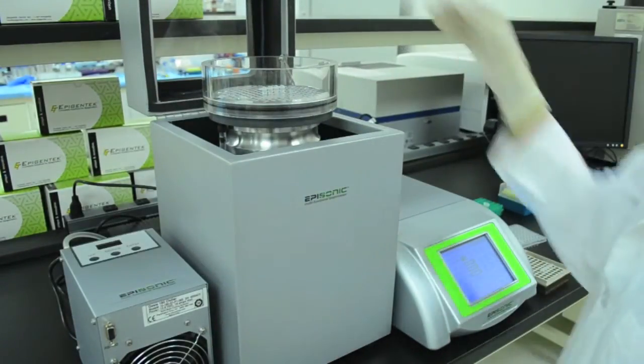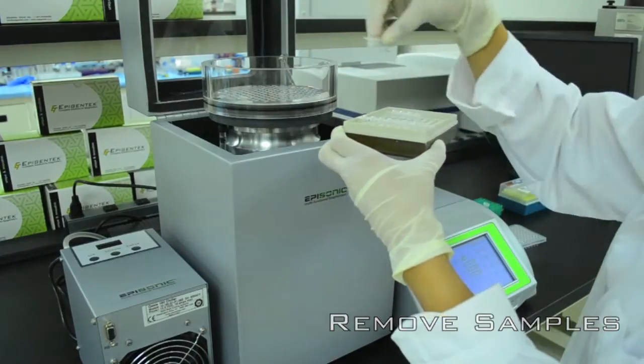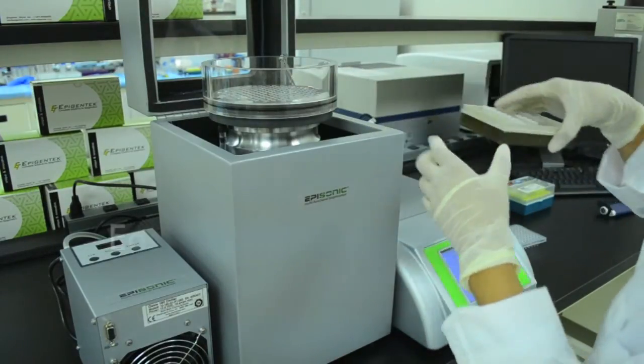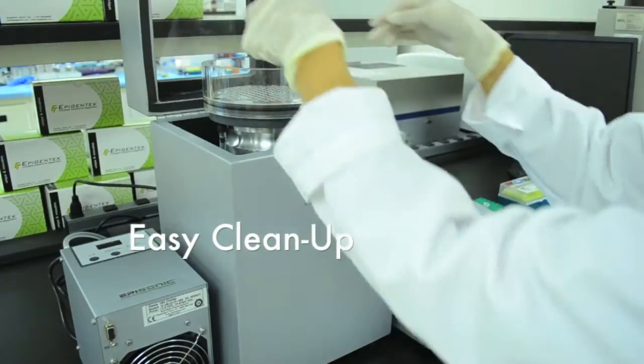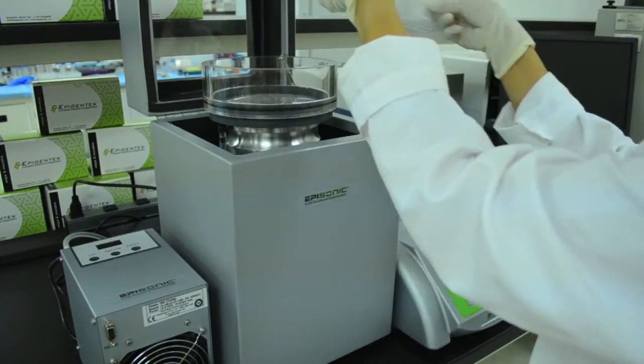Once finished, your samples are now ready for your downstream applications. Cleanup is easy — just remove the rack, drain the water with a quick-release mechanism in the tubing, and wipe down the sonication processing horn.